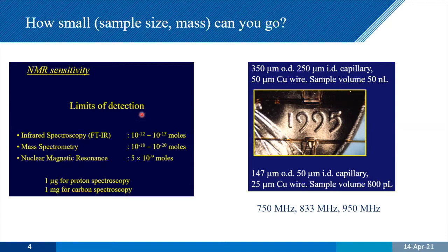How do we get the maximum sensitivity? Well, we make the coil as small as possible. And so this is going to the extreme, right? This is the 1 cent that's in all of your pockets at the moment. And so this is a coil here, which is less than 150 microns in diameter. So we're going to take a sample and we're going to concentrate it as much as we can. We're going to put it inside this very, very small coil.